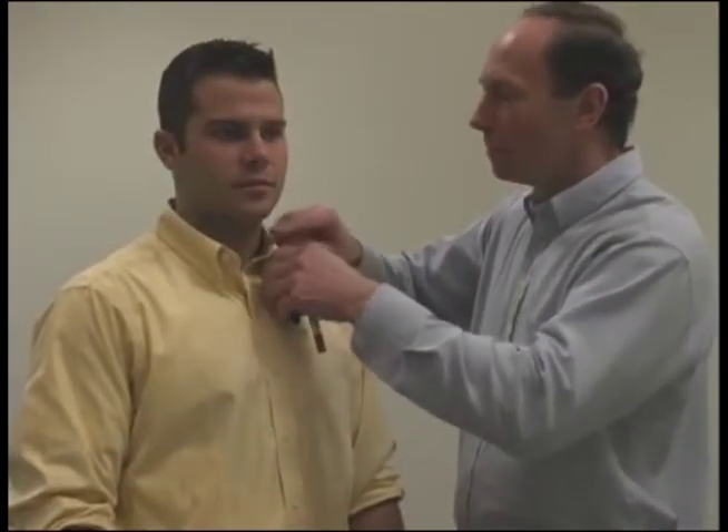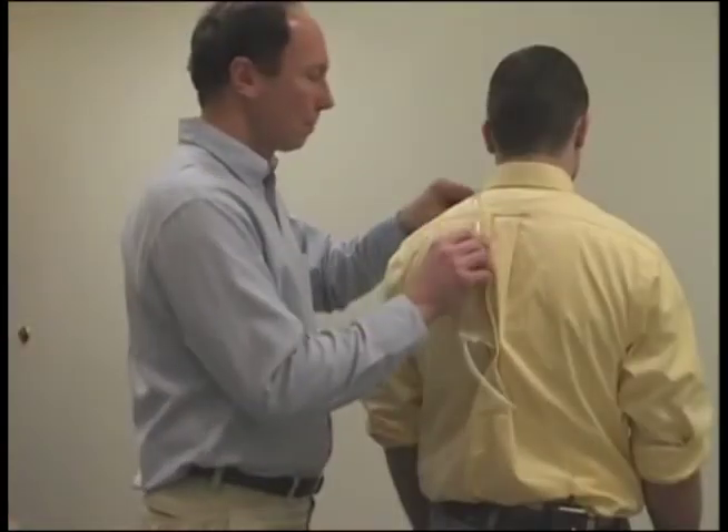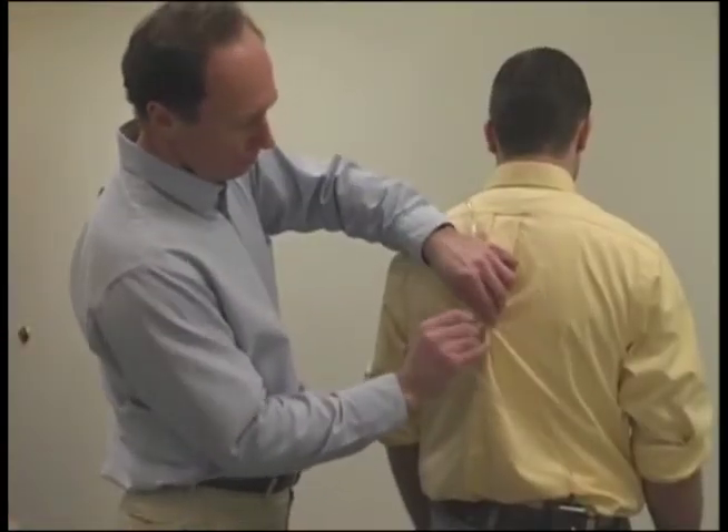Attach the filter cyclone holder to the worker's collar with the cyclone pointed down. Bring the tubing up and around their back. Use the tubing clip to attach the tubing in place along their shirt so it is not swaying away from their body.